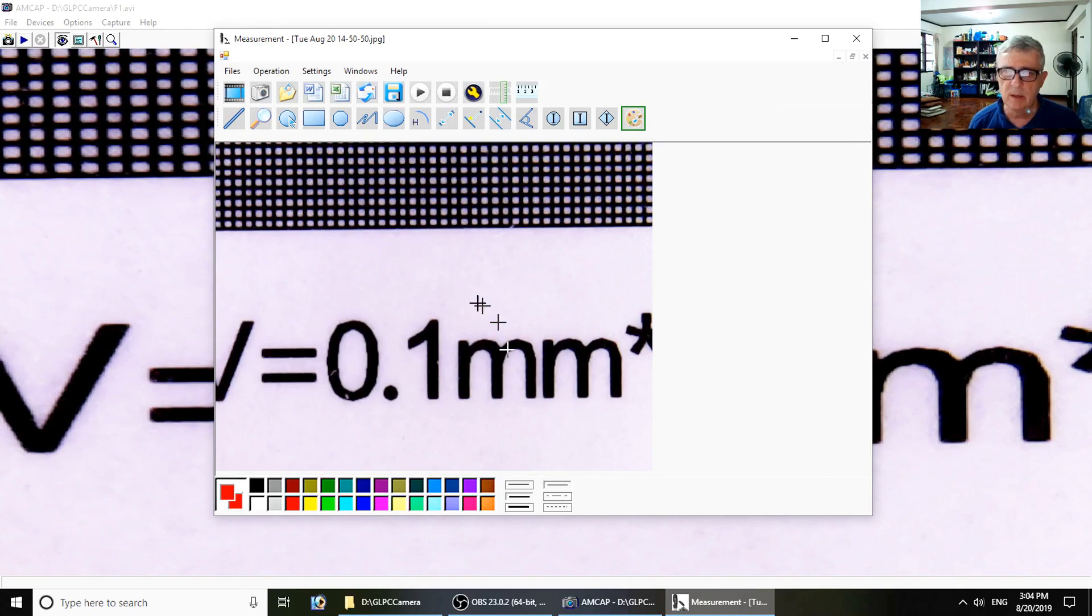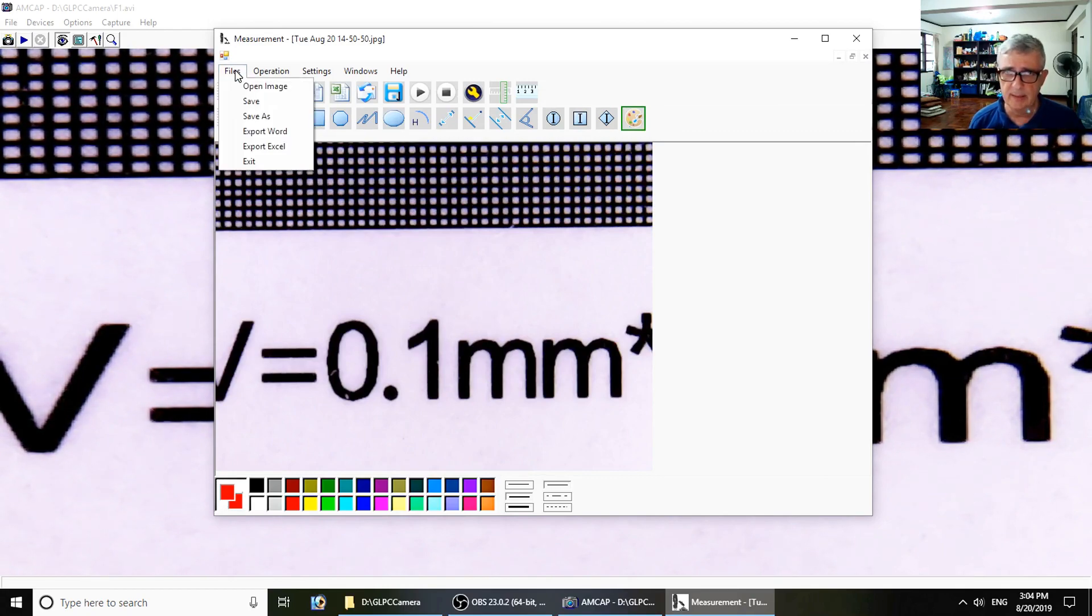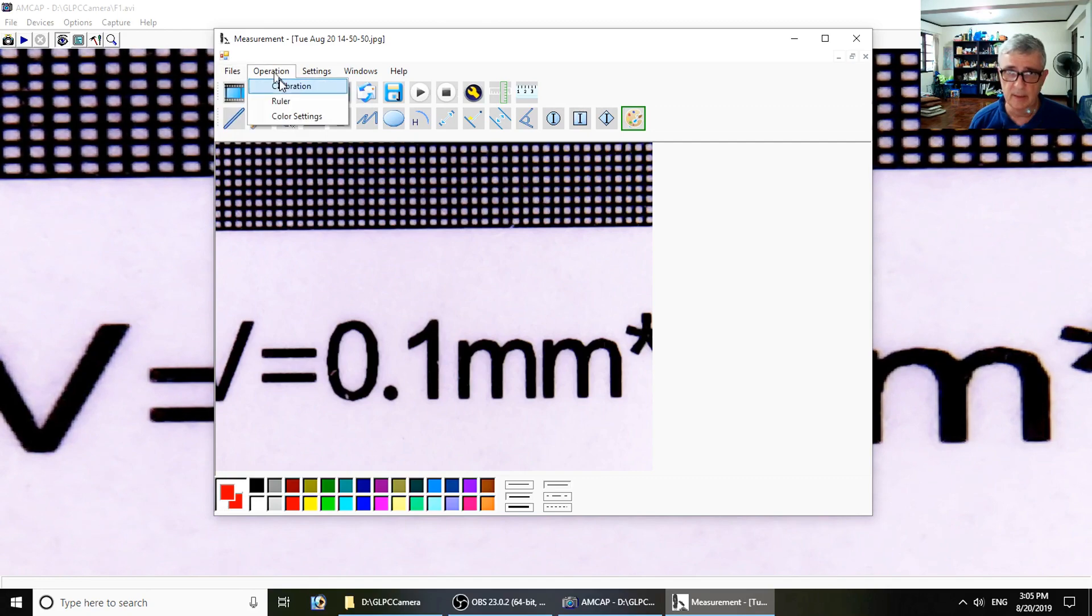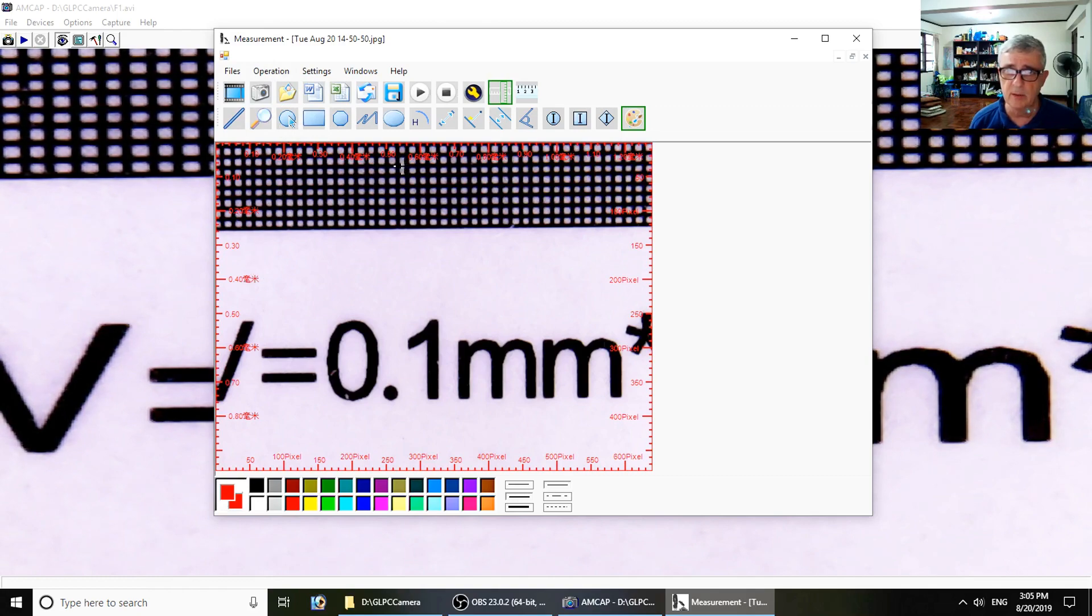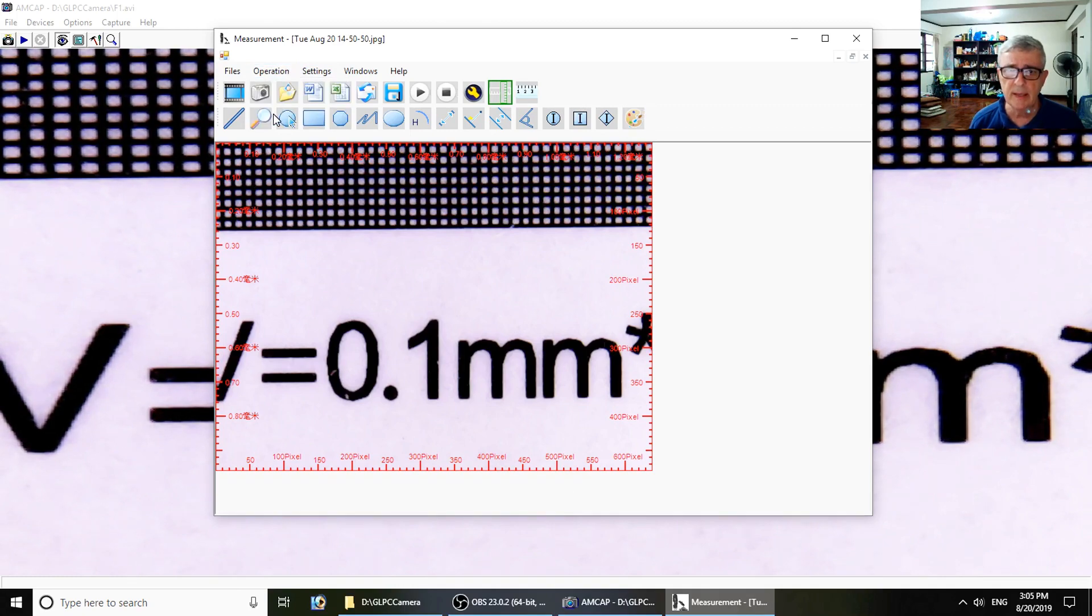This is our image I took earlier. The software is pretty easy. It allows you to open image, save, export as Word, Excel. It also allows you to export it as other things. Calibration is obvious. Ruler puts this around the outside, which is in pixels, and it's both Chinese and English.